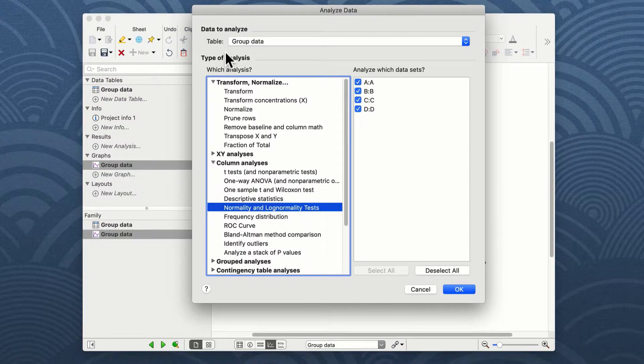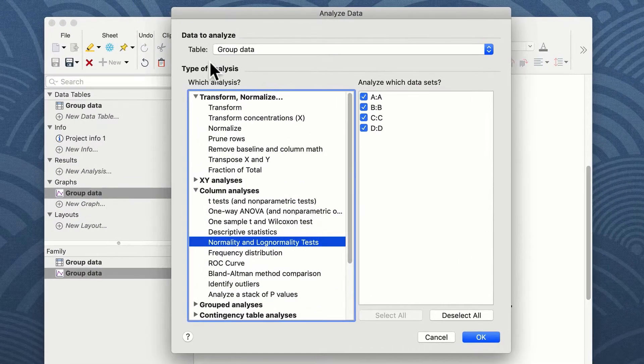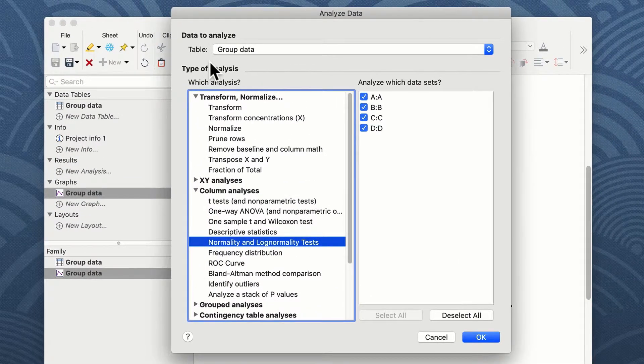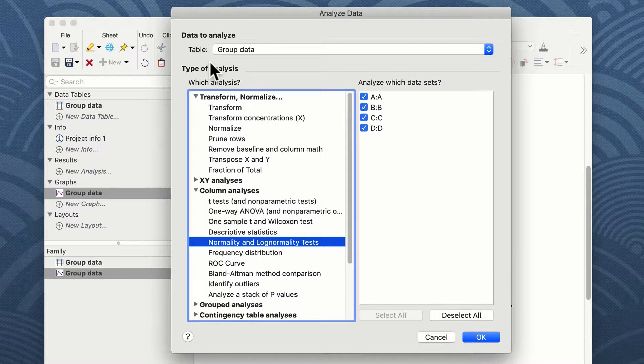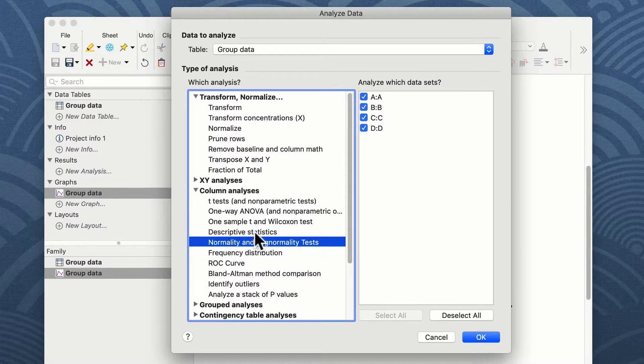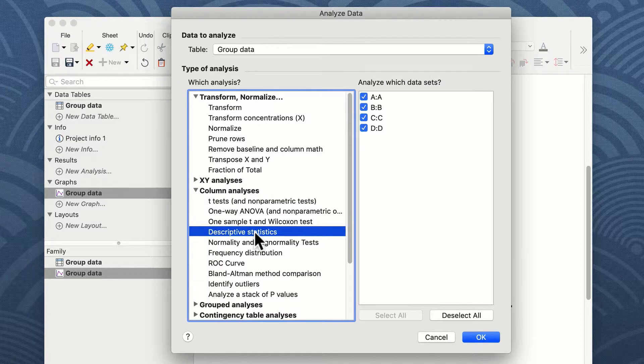When you click on the analyze data, you get the analyze data option window, and from here you can choose a number of analyses from the selection on the left-hand side. I want to look at the descriptive statistics of these data, so I'm going to click on descriptive statistics from the column analyses option.